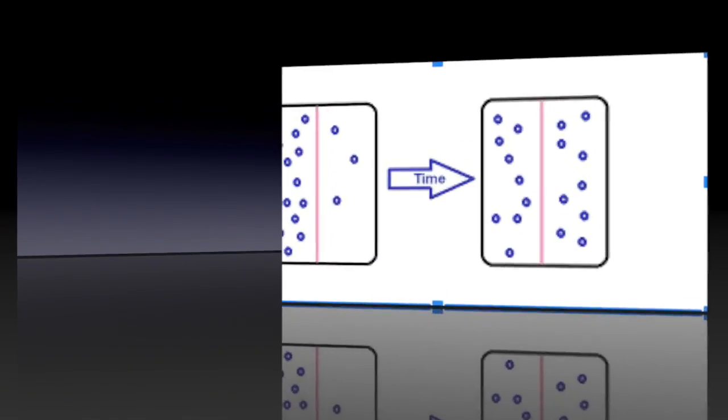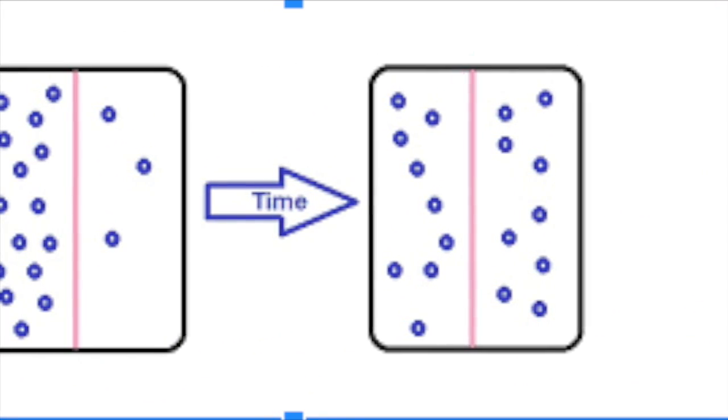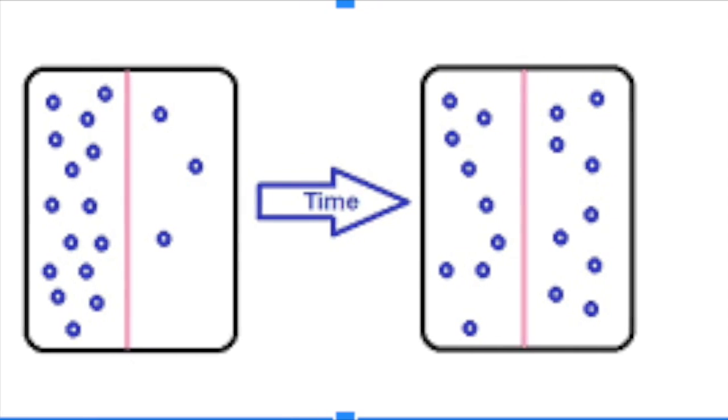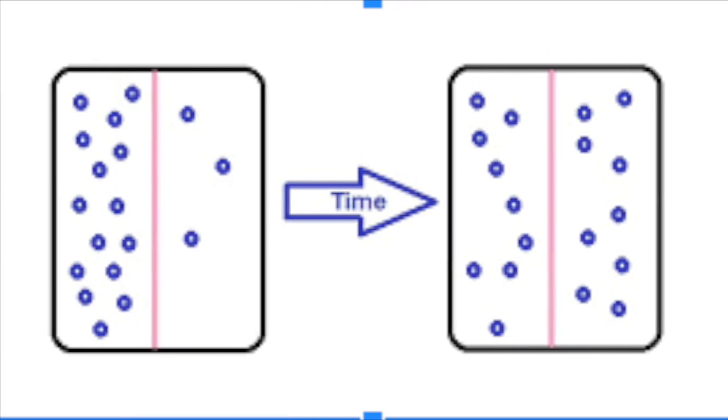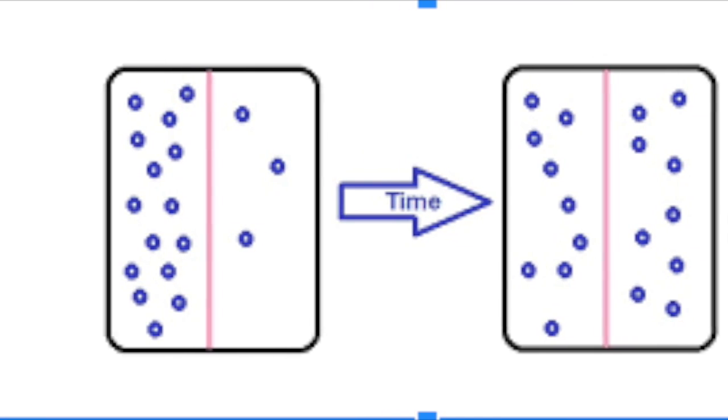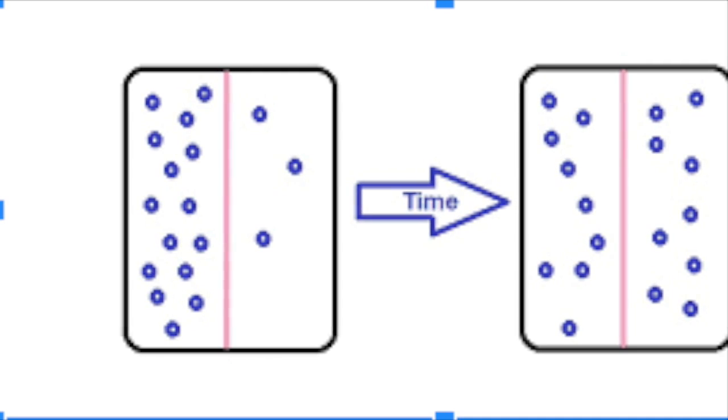In class, we learned about diffusion. Underneath the microscope, we are able to analyze and record the movement of multiple beads in the trials. We hypothesized that the larger the size of beads in the water solution, the lower the average rate of diffusion compared to those who are smaller in size. Once uploaded to Tracker, we are able to analyze the different velocities of the individual beads.